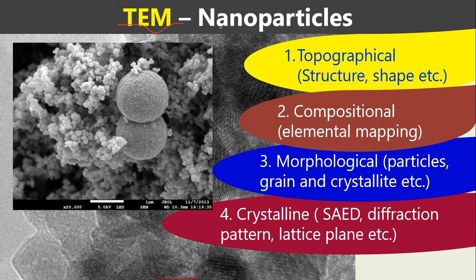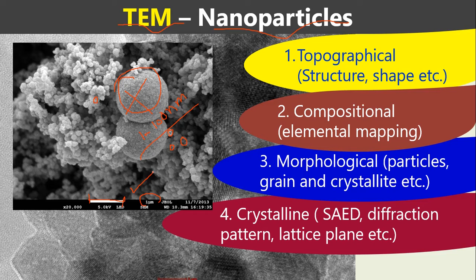These are images of nanoparticles. The big one cannot be called a nanoparticle because it is not in the nanoscale. As explained, at least one dimension of a sample needs to be in the range of 1 to 100 nanometers to be called a nanomaterial. There are also some hollow nanoparticles visible here. The scale bar is in microns, and these small particles are in the nanoscale.